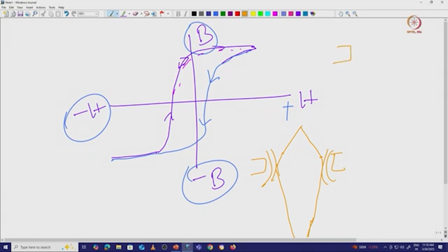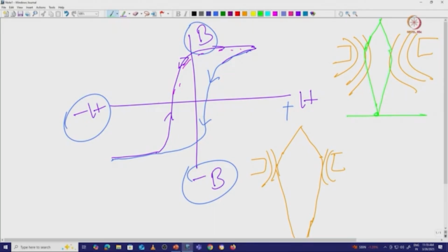Now we have the same magnetic lens and a very strong magnetic field, and we are trying to converge this electron beam very hard. When the electron beam comes, after a certain time, because the magnetic field is strong, it will start deviating in this way. You can see that in this particular case they formed an image here. In the other case, it crosses the image plane and cannot converge, but here it is converging because of this strong electromagnetic field. Okay, fine. I am using my lens as a very strong electromagnetic field.